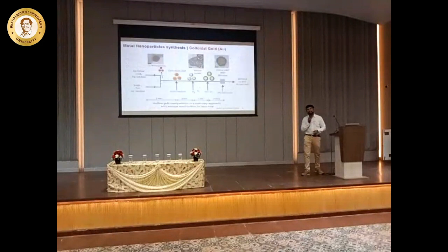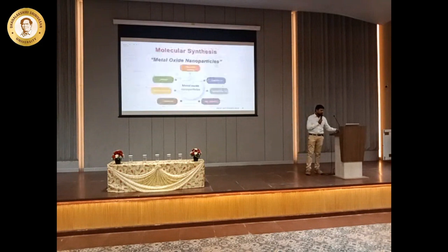So here, another example is gold core-shell nanoparticles, wherein you have cobalt and gold. So you have gold solutions. You had all these three things in the channels, and then slowly it forms hollow gold nanoparticles, and then you finally create gold PEGylated structures.